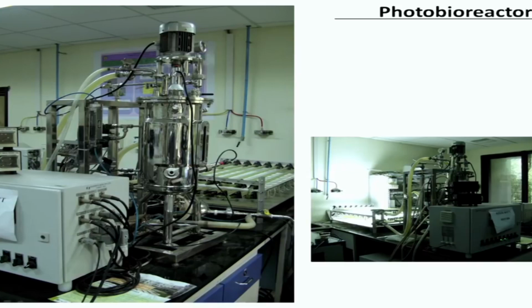It is the same reactor that is taken from our lab. We use a photobioreactor. We did some work on microalgae. So, in this vessel, there is an outlet which goes into the photo section. The organisms receive light here when they are in the photo section, which is made up of glass tubes, and then they return to the vessel, and that happens continuously. So, this is a photobioreactor.